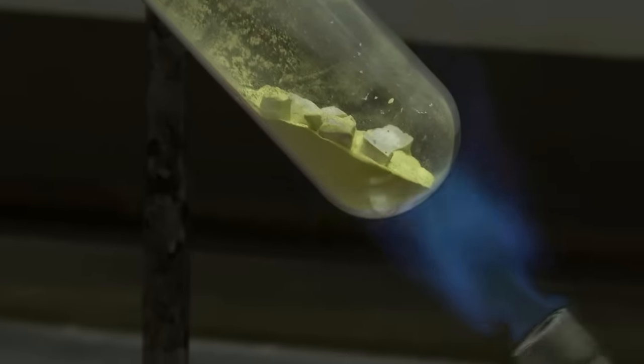So yeah, we've got a really nice blue solution, as you can see against the backdrop of my lab coat. And again, that's those electrons hopping between the different tungsten units in the POM. So it's the tungsten that's bringing the blue? Yeah. So we've taken tungsten 6, which was in its most oxidized state. And we've reduced one of those to a tungsten 5. But that electron can hop around those 18 tungsten atoms. And because they're very similar in chemical structure, there's a very small energy barrier. So that manifests as a nice blue color.